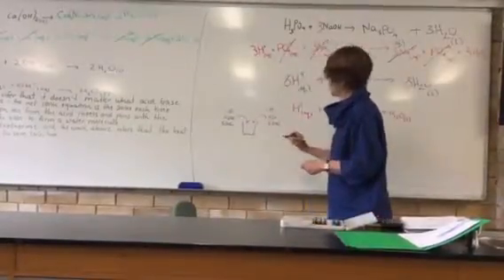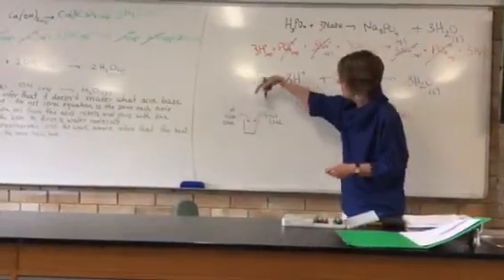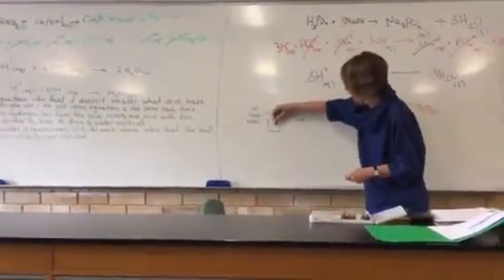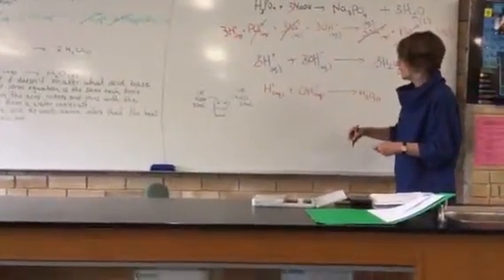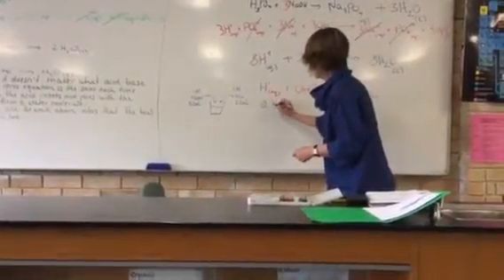So the aim would be to get the temperature of one of the solutions, which is your beginning temperature, add in the 50 mils of the other solution, stir with your thermometer and record the highest temperature change. And that's the one that's relevant in our equation. So we know using the MC delta T calculation requires 3 steps.